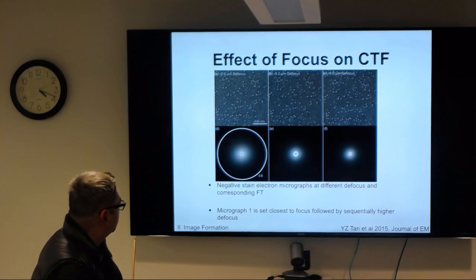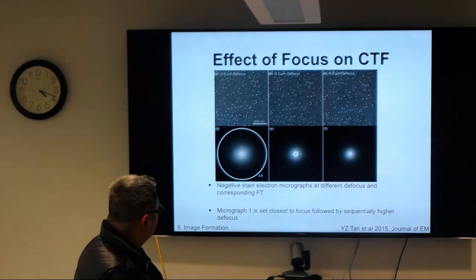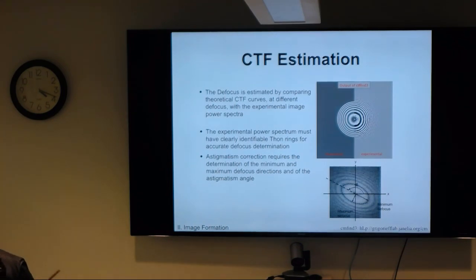When you're doing image collection, you're doing a range of different focus values. Does it always proceed in the same order so that you aren't biasing? I think the different programs probably do it differently. They all have different algorithms. The software we use, called Leginon, uses a Python random number generator to choose.